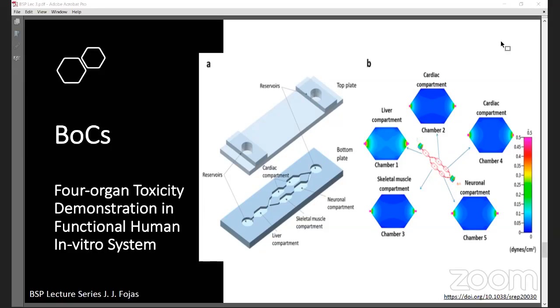And then here you can also see a schematic view of the compartments at the bottom, and then the 2 holders for the separate culture devices. And they also did, as I mentioned, shear stress distribution, which is on the right side of the image.